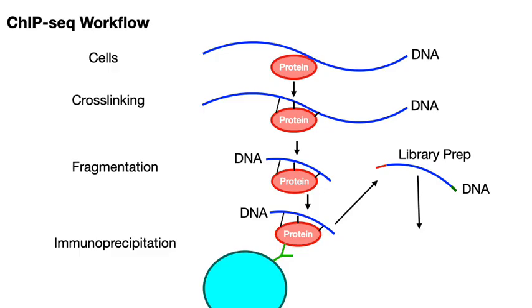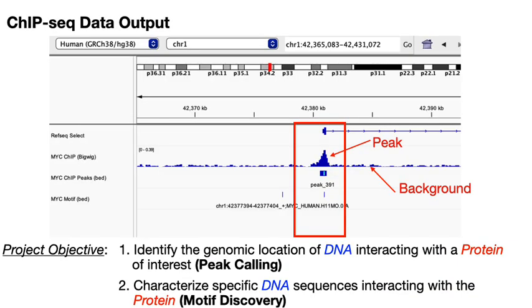And then the analysis begins. We will map our DNA to the genome without splicing. Let's see what happens now. The output of the analysis is that we can define a ChIP peak. So for example, you can see here we have defined a ChIP peak. There's enrichment. The way that we define a ChIP peak is that there's enrichment beyond the background. Additionally, from this, we can also generate motifs. And we can map those motifs to see where they are in the chromatin.